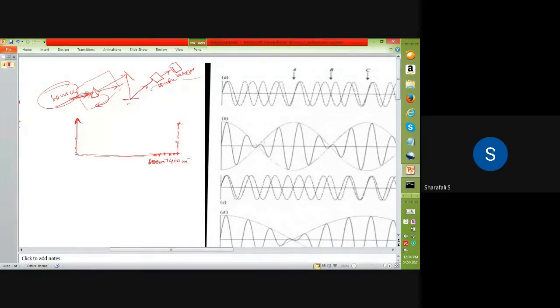And measuring 400 and something else also is coming out. This one also coming out. And at this frequency, there is some vibrational band associated with this frequency in that particular sample. At this frequency also, there is some particular group which is absorbing that particular frequency, and we have something like this. And if you plot for all the frequencies, then we will get different bands at a different frequency position correspondingly, like this.